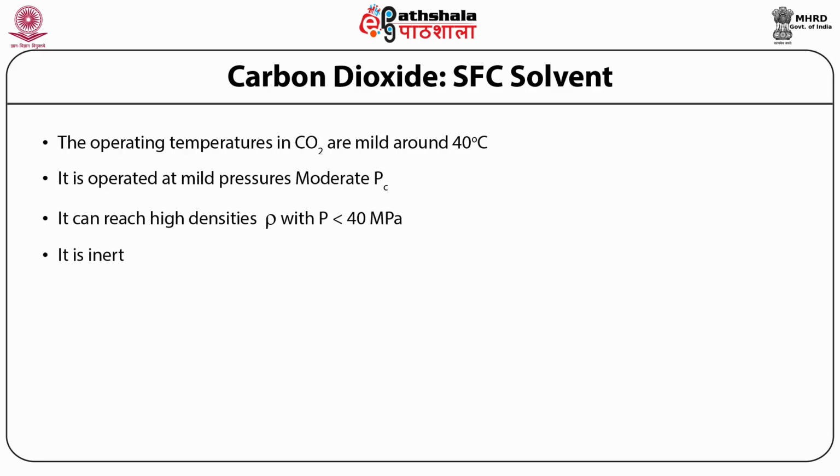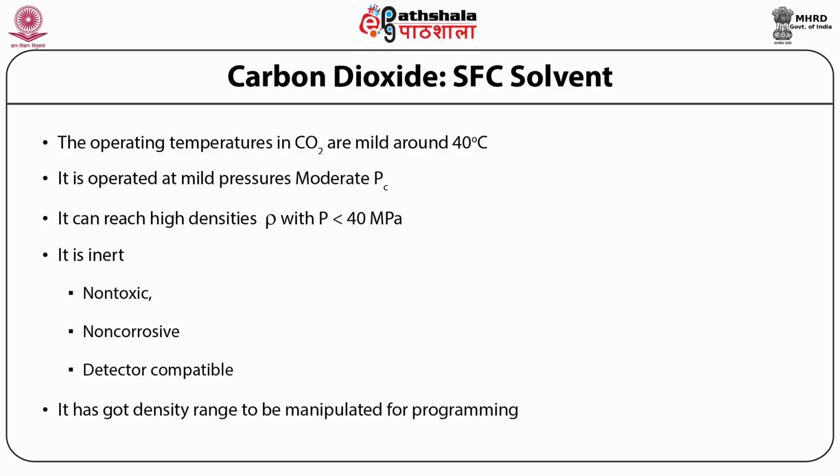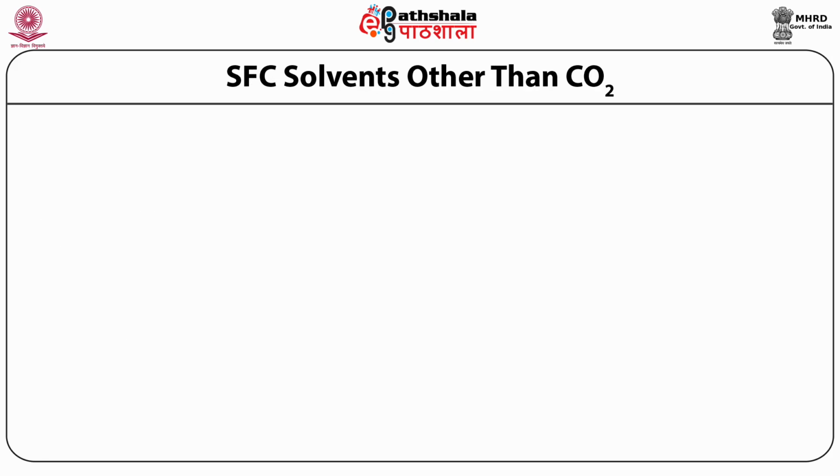It is inert, non-toxic and non-corrosive. It is compatible with various detectors and has a wide range of densities that can be modified by changing the operating conditions.